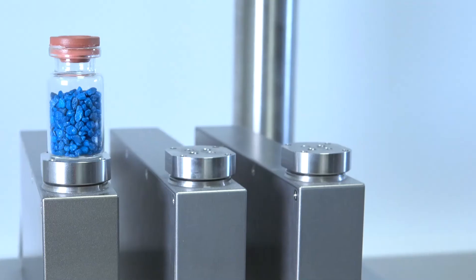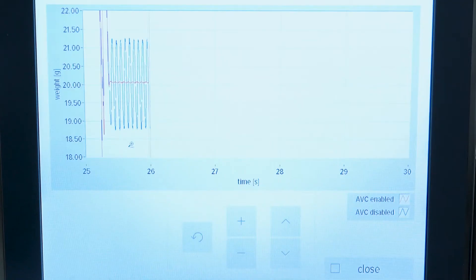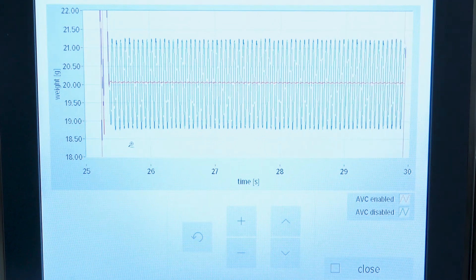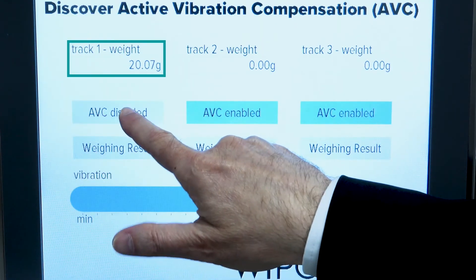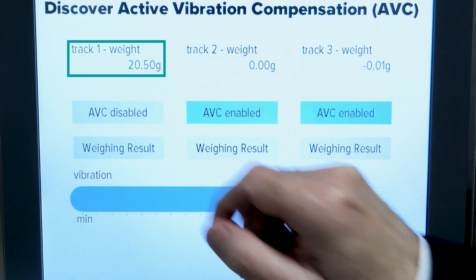Here we create vibrations to demonstrate the performance of AVC. The blue graph demonstrates the weighing results without AVC, and the red line shows the performance of the weigh cells with AVC switched on — a huge difference in performance. You can also see this on the jumping weight, which represents the graph we have seen before.